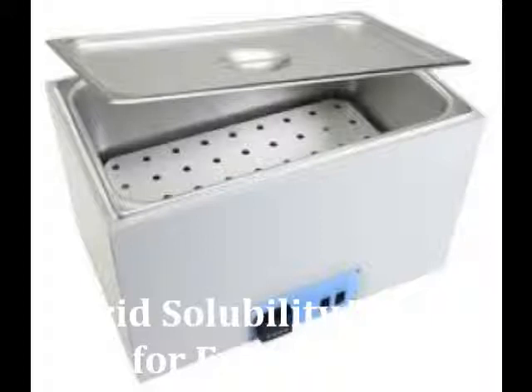The results you want to get from your acid solubility, from the American Petroleum Institute recommended practices, for sand sizes of 6/12 through 30/50, those are mesh sizes, for frac sand, you want less than 2% of the mass as being soluble in the acid. And sieve sizes 40/70 through 70/140, you want less than 3%. So the acid solubility test, one of the many tests performed to determine whether or not you have frac sand.